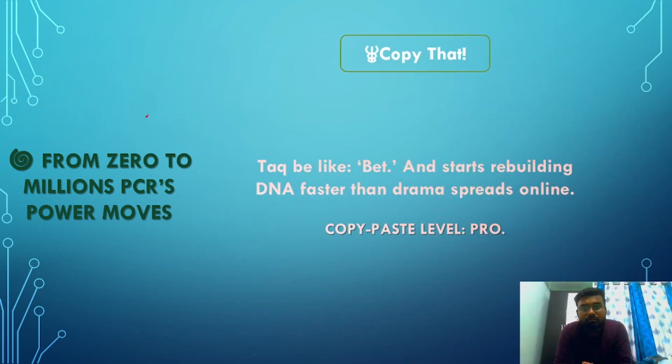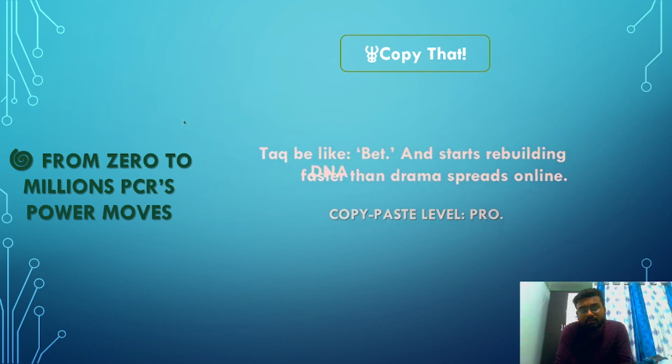Next, copy. Copy-paste means here the Taq DNA polymerase comes into action. Okay, you got your reactions. You got your perfect match here. Now Taq DNA polymerase comes into action. Now it will replicate the things based on the template.